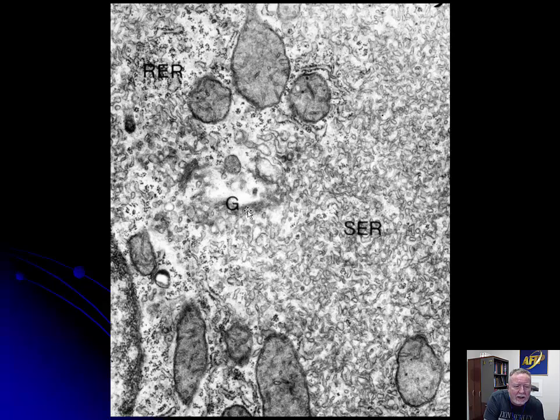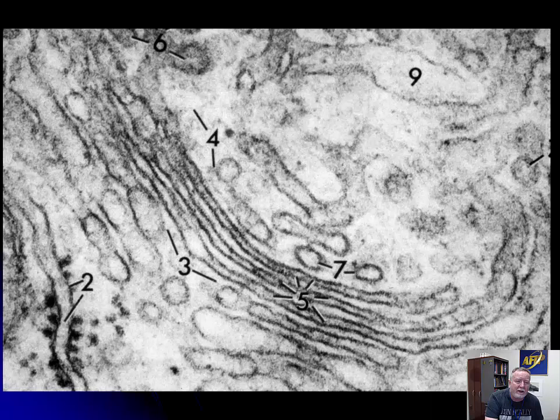If you're lucky enough to have letters here, here is a G, and that stands for Golgi apparatus. And the Golgi is a very important organ. It is like the post office of the cells. Protein that leaves the nucleus generally goes into the Golgi, where it is addressed. They put an addressing on, and that tells it where in the cell or outside the cell it's going to go. Maybe it'll say you're going to go up to the cell membrane and make a patch there, or you're going to go into one of the mitochondria. And all that happens in the Golgi.